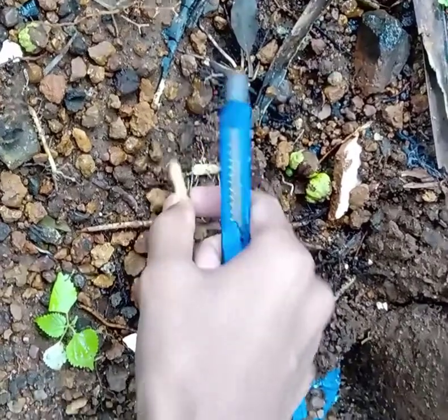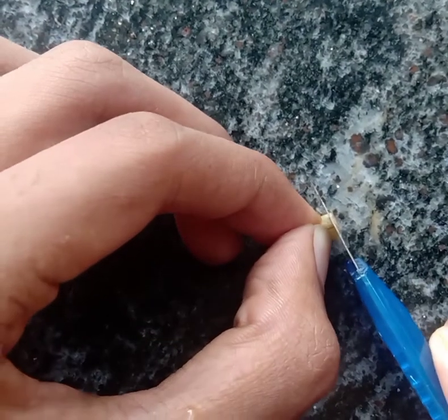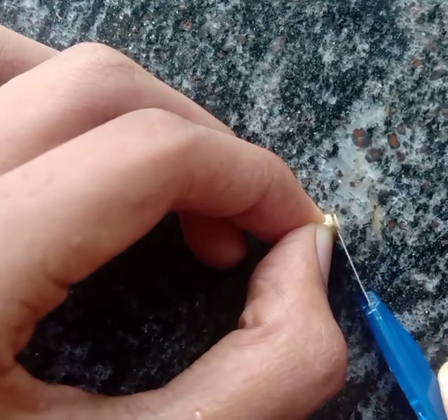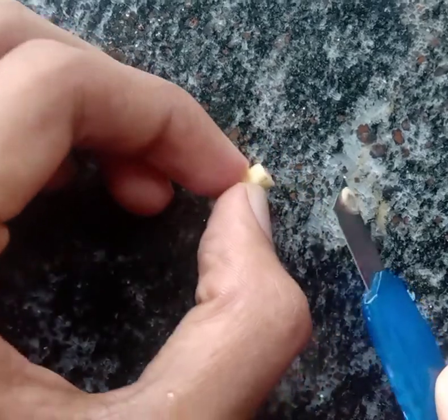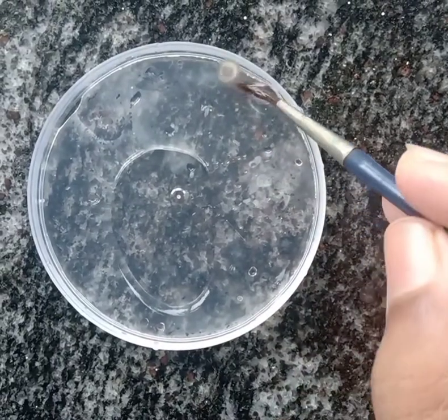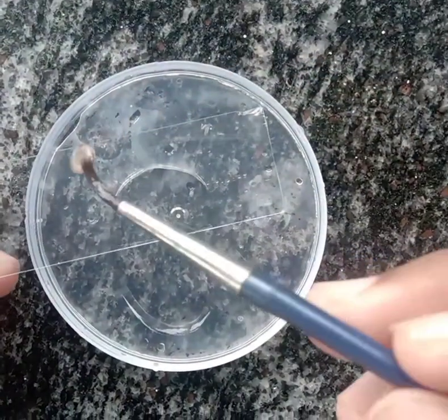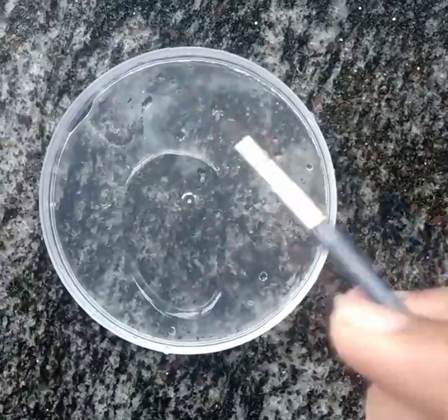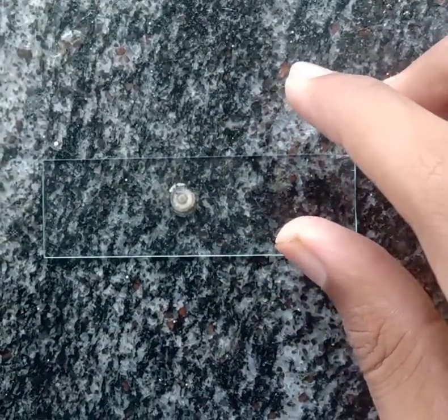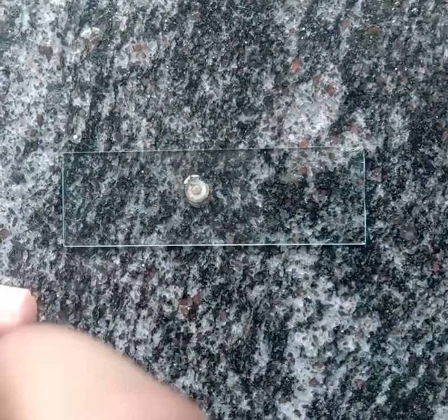First, let us take a small piece of root from a banana plant, then take a thin cross section using a blade. Wash it with water and place it on the slide. Now, let us stain the cross section using one or two drops of stain.